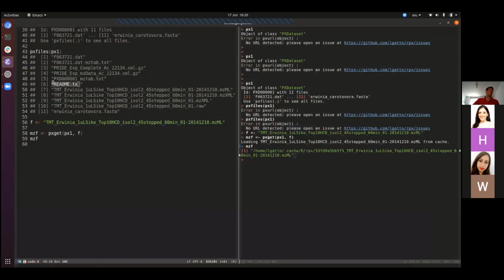I could download that and read it in with read.csv into R to get the sample annotation. But the submission of these data doesn't necessarily require the data to be fully annotated. So that's quite disappointing.